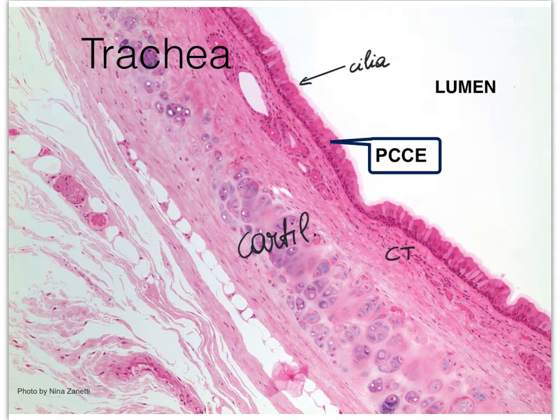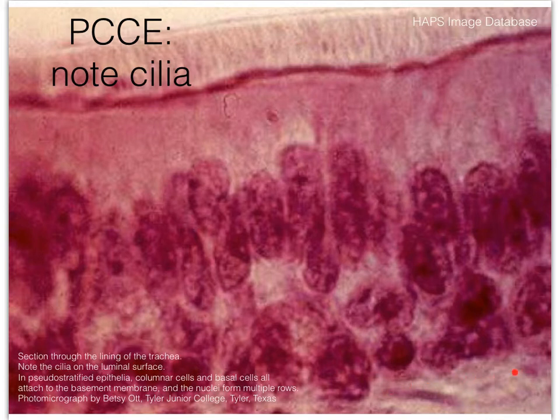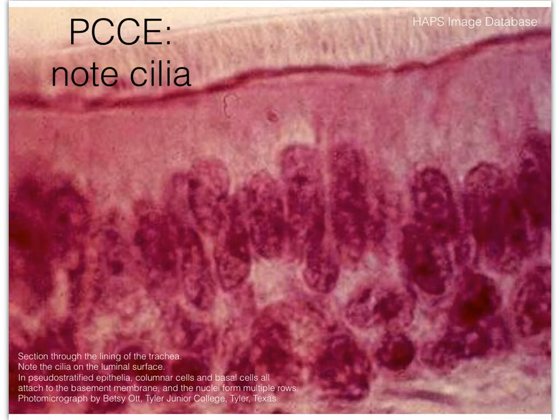The cilia are going to help with moving any particles trying to get into our lungs via the trachea, moving them back up towards the mouth. Here at very high magnification, let me get you oriented — right here is the apical surface, and here we see the cilia arising from it. The basement membrane is down below. Notice that the nuclei are kind of all over the place, which is what makes it difficult sometimes to identify this tissue as pseudostratified. I'm using this to illustrate how the nuclei are all over the place.